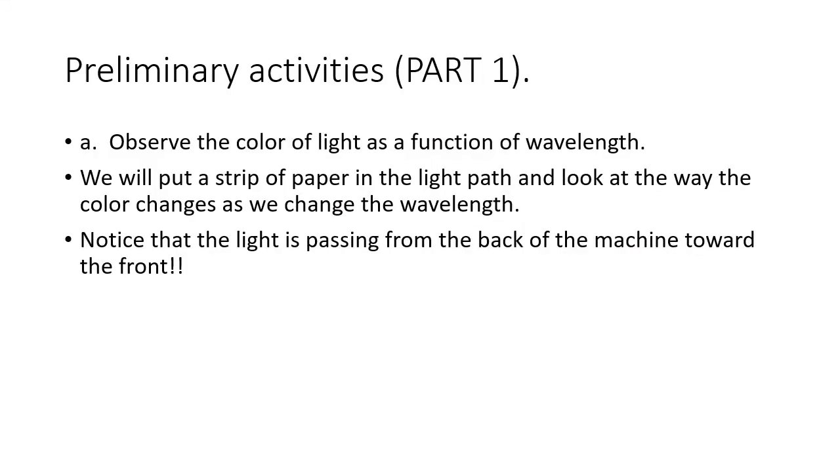Okay, so part one of the activities, and we're all going to do that first. What we're going to do is observe the color of light as a function of wavelength. This is to get used to the spec and thinking about what volume of sample you need to put in the spec and how dense the sample can be and still work.